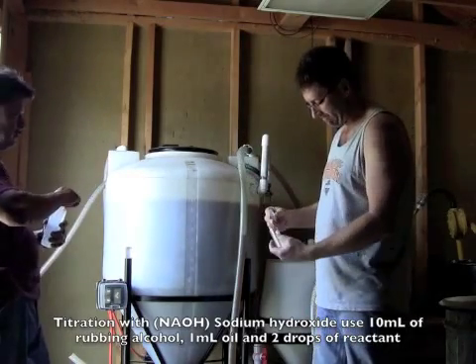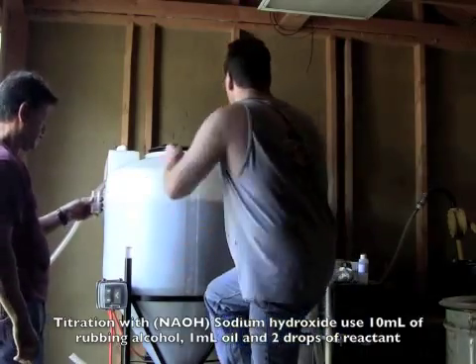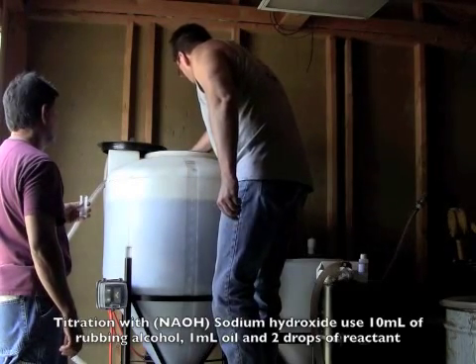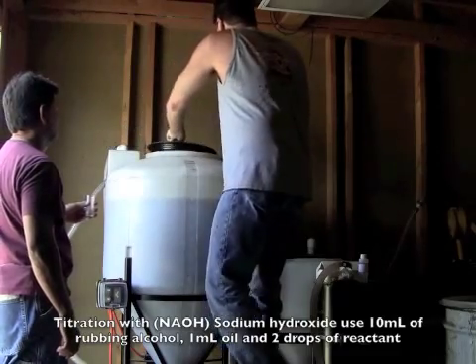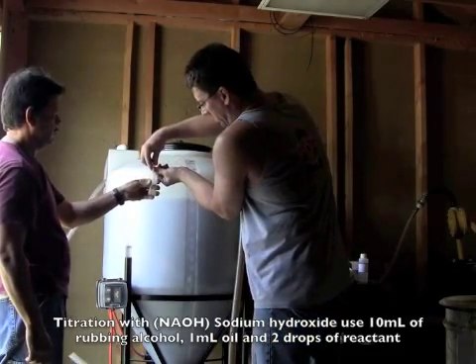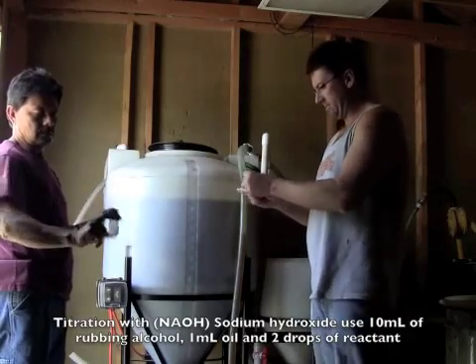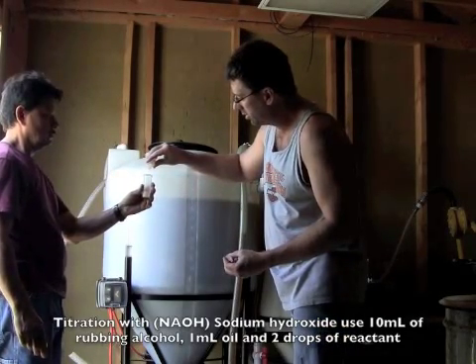There's 10 milliliters of rubbing alcohol in the vial. Now we've got one milliliter of oil. Mix that up a little bit and we're going to add two drops of reactants — one, two — there we go.